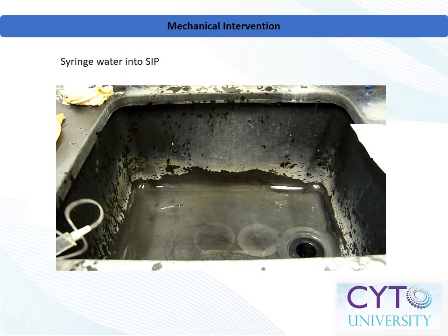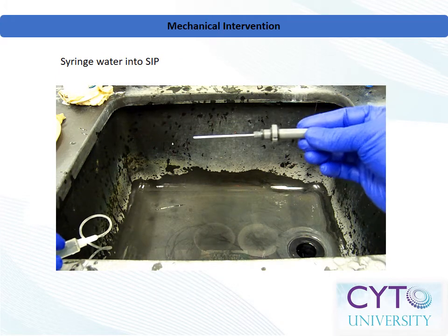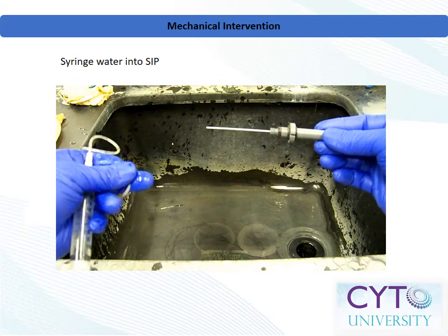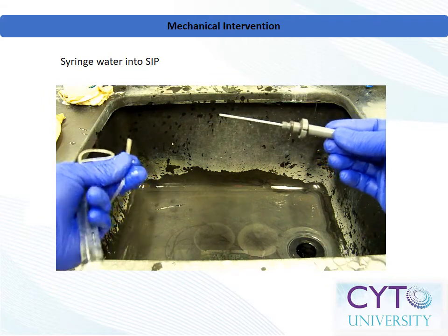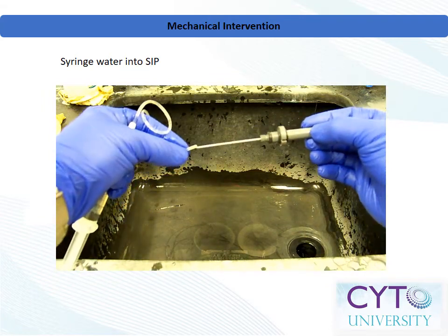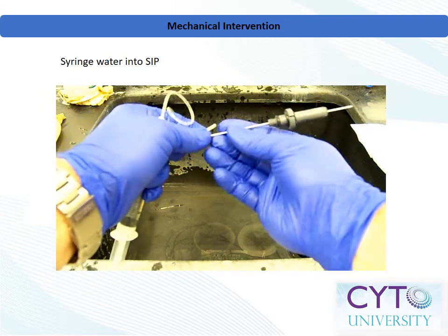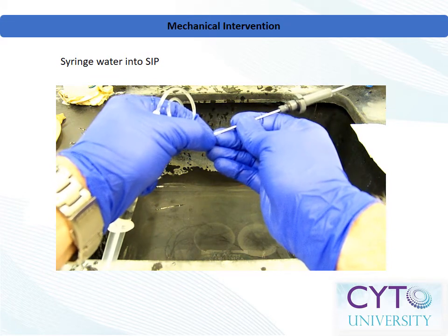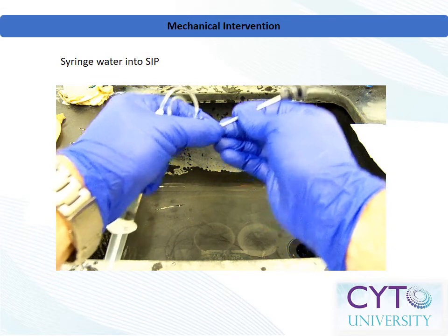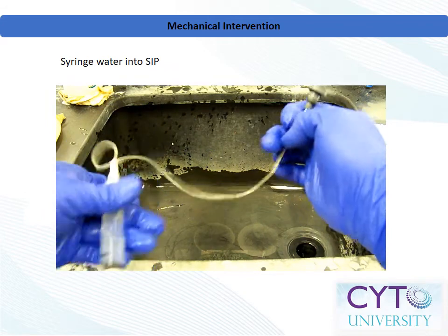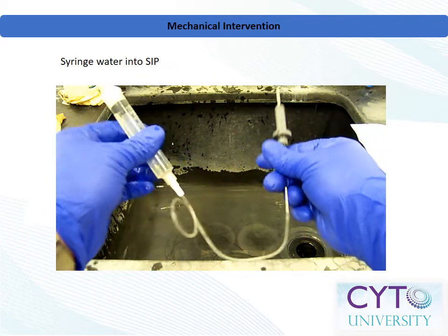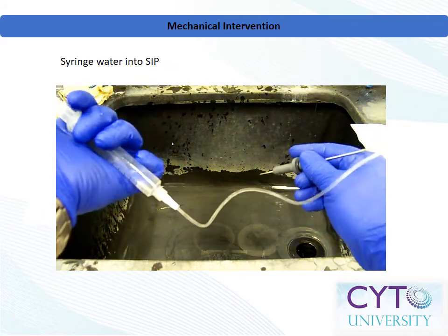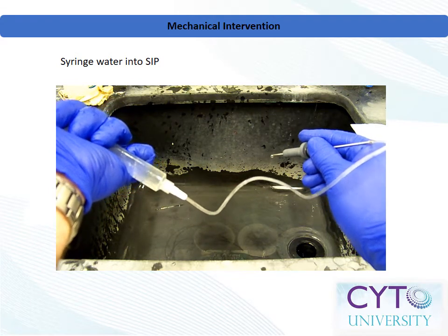As a second option, modify a butterfly syringe by cutting the tubing just above the needle. Then push the flexible tubing onto the flat end of the inner sample injection tube. Fill the syringe with cleaning solution and connect it to the lure fitting of the butterfly's tubing. Depress the syringe plunger, forcing cleanser through the inner sample injection tube.